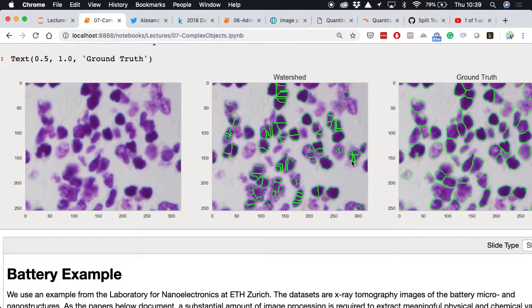And so with this, you could obviously set a minimum sized object you want it to get. And if it's below a minimum, then you delete the objects and then you regrow it, and you do that iteratively. But it's still going to be quite tricky for objects like this, where they're just shaped very oddly.